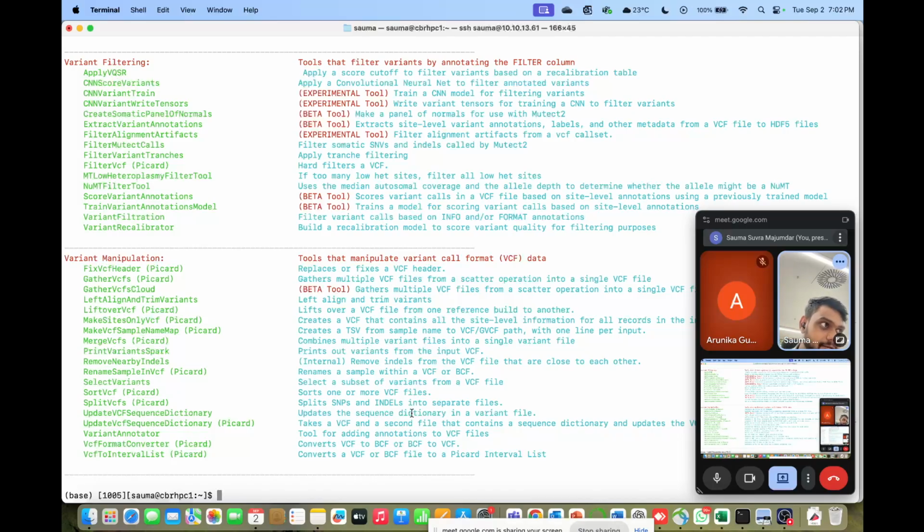These will be big data sets that you have to run, so this will take time. I cannot do it in like 5 minutes. It will take a lot of time, an hour. For example, if you give BWA-MEM the whole genome sequencing FASTQ file, it'll take 30 to 40 hours to align all the reads for one sample. So it's a long period of time.